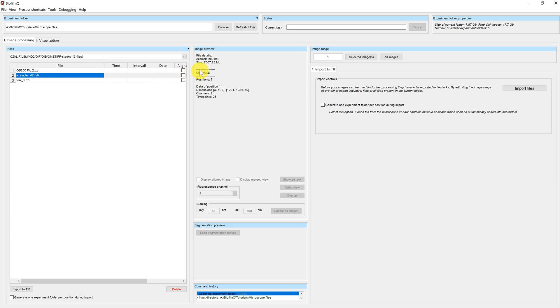This information is being updated when you click on another file. So you can see, for example, in the ND2 file, we have seven positions, two channels and 25 time points.